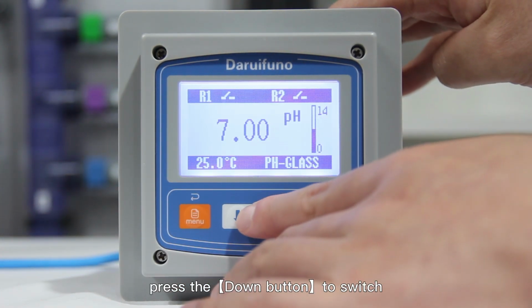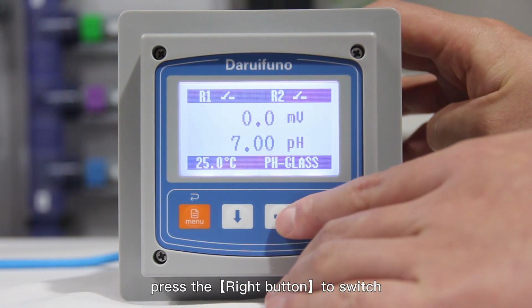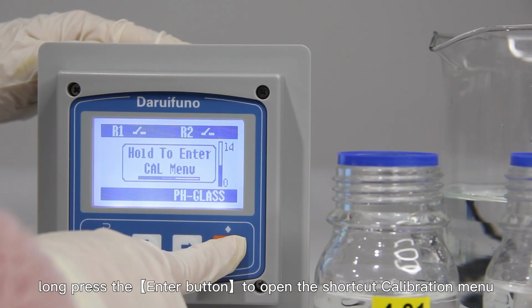Press the down button to switch between the two secondary display modes. Press the right button to switch between the two measurement value display modes. Long press the enter button to open the shortcut calibration menu.